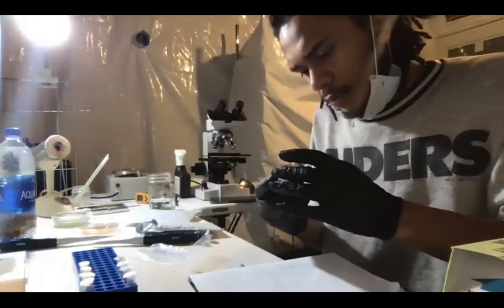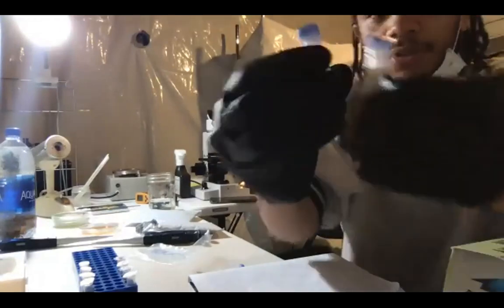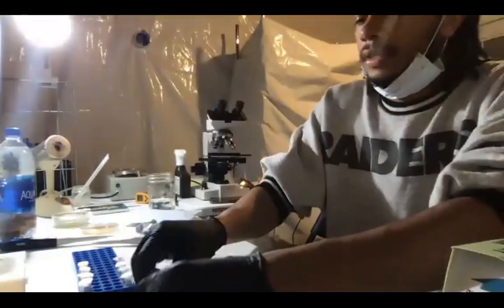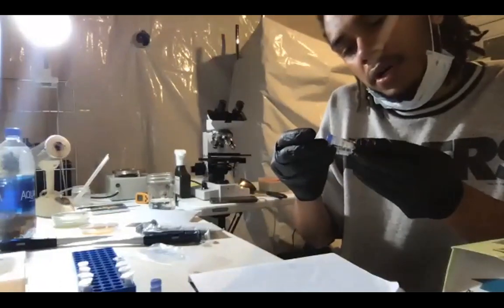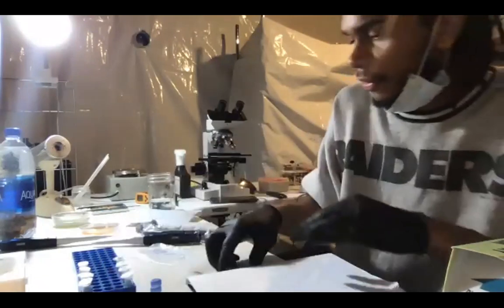So I have MAT111F, MAT111R. They come to you like this, and they're 10 times too strong for the reaction. They'll completely mess up your reaction at this concentration, so you need to dilute these. And then we have MAT121F and 121R. The F and the R stand for forward and reverse.